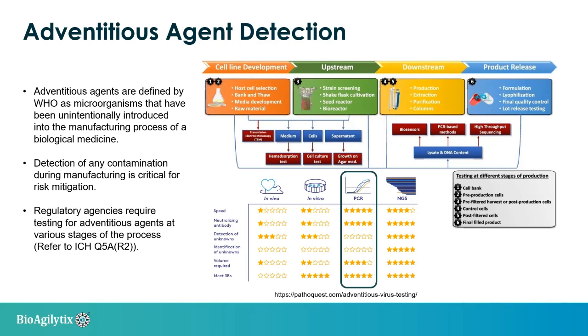detection. As a fast, highly sensitive and specific assay, PCR is suitable for testing downstream in-process samples and the final product. Now I'm passing it back to Amanda.